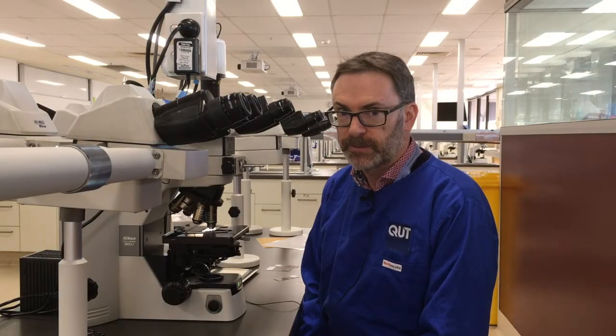Welcome to this troubleshooting video on elastin stains. We're going to start with some very similar sections to the ones stained in the protocol video. These first ones are Verhoff-Van Giesen applied to sections of esophagus.